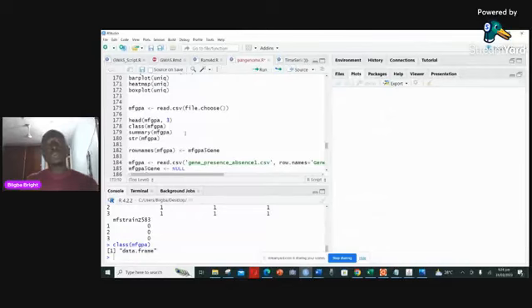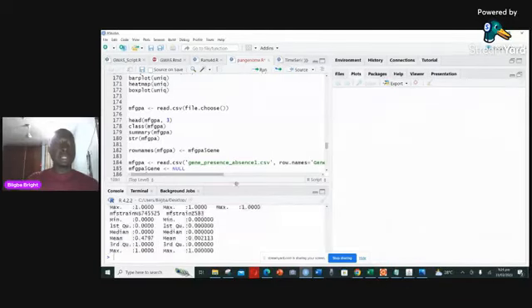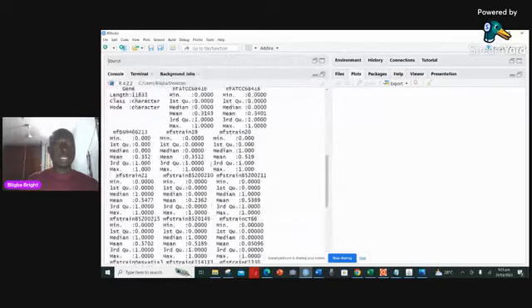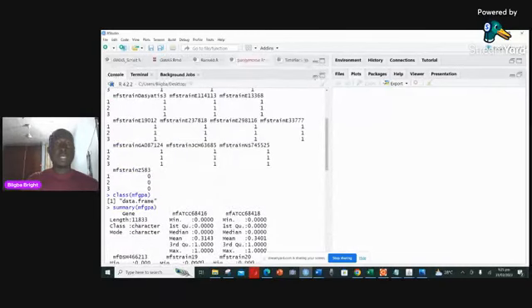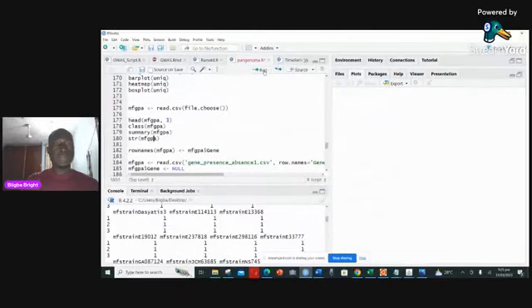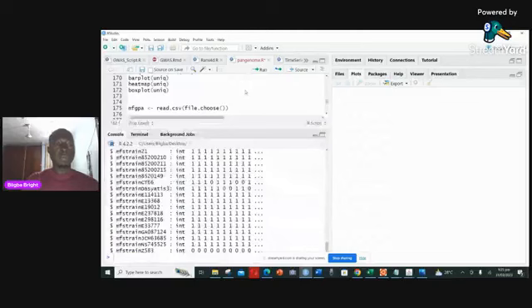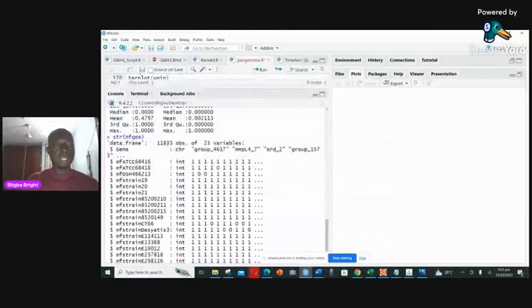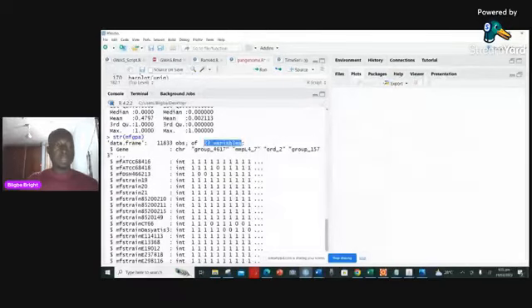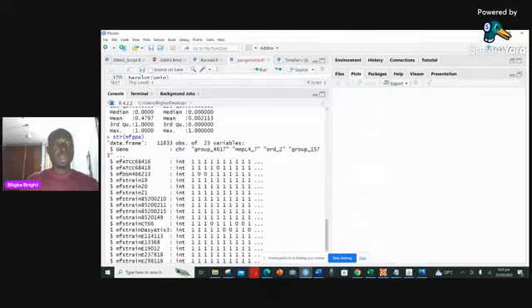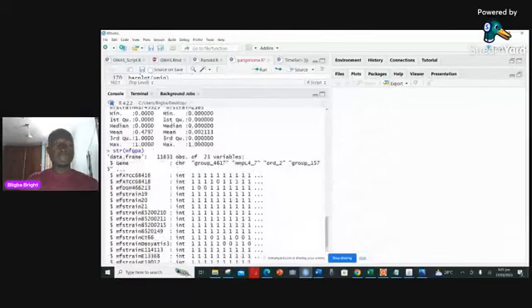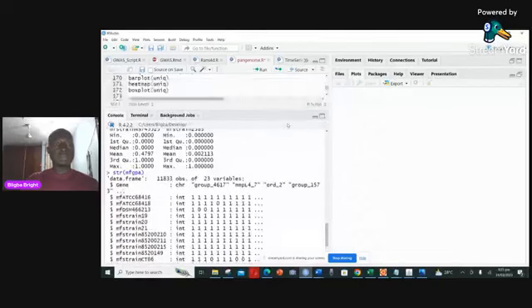We also want to look at the summary — we do the summary mainly to check whether there are any NA values. If summary() runs and everything comes up fine, it means you don't have any missing values. Then we look at the structure. The structure gives you all the information. We actually have about 11,833 observations and 23 variables. Out of those, the first variable is a character — it's important to know that — and the rest are integers.